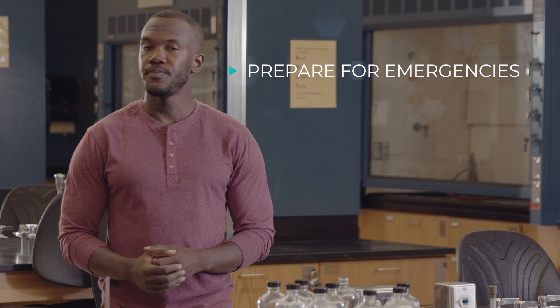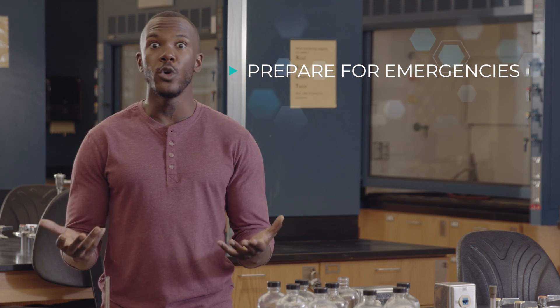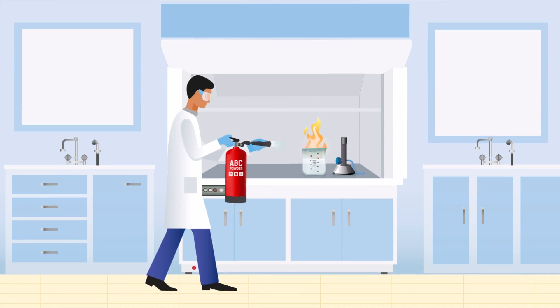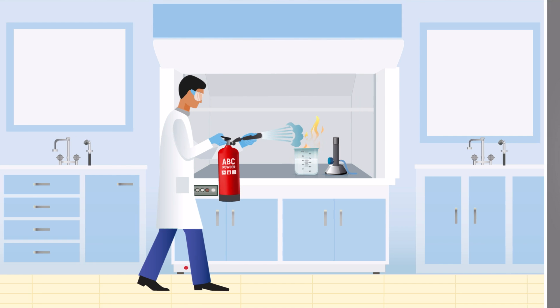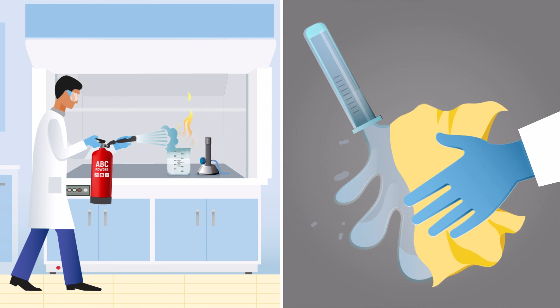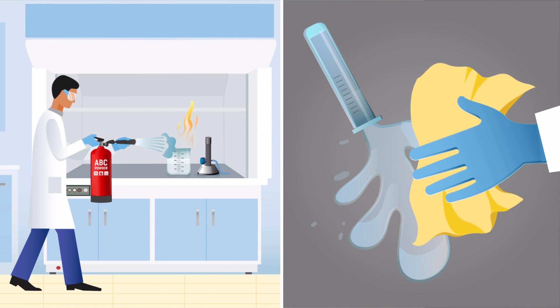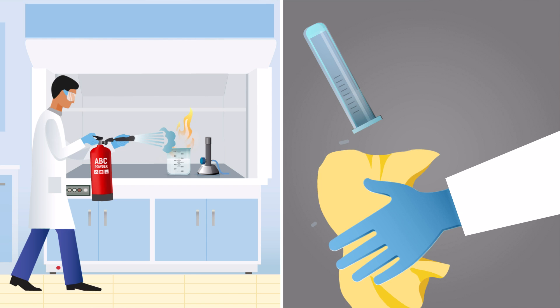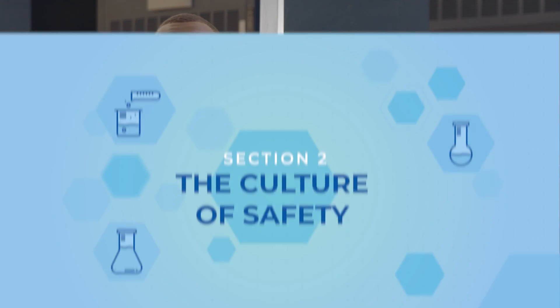The final step in RAMP is to prepare for emergencies. If something goes wrong, are you prepared? Do you know how to handle a fire or respond to a spill? We go over these scenarios in more detail in other videos, but just remember that you should consciously think about what might go wrong in an experiment and then be ready to respond.